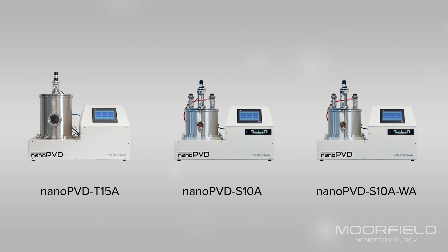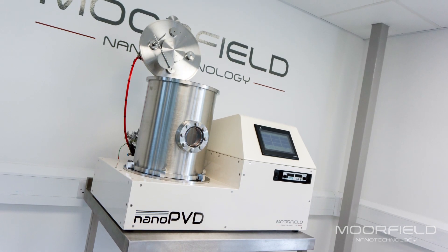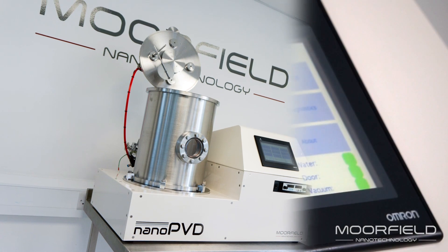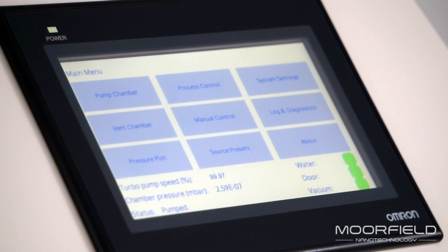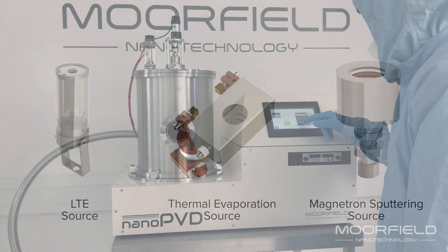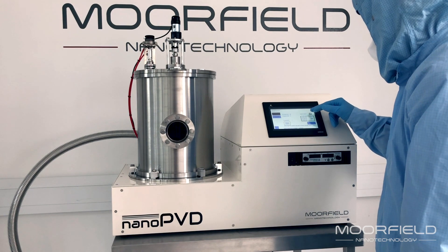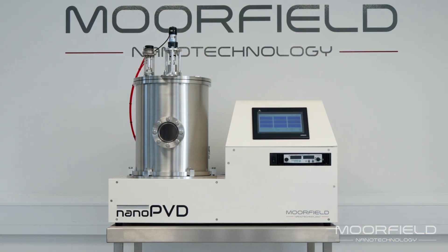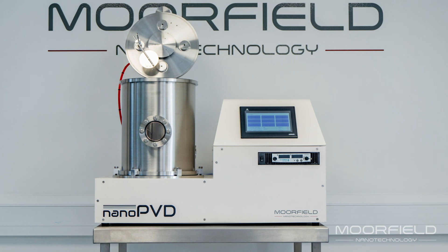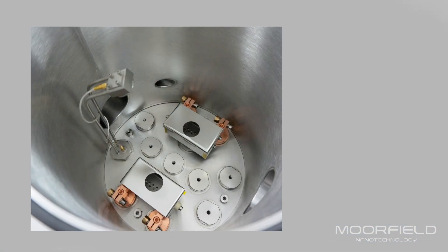All tools are fitted with stainless steel chambers and turbo molecular pumping systems for base pressures better than 5×10⁻⁷ millibar. Tools are available with different coating techniques and are packaged into a compact frame suitable for benchtop location. Model T15A is a thermal evaporation tool with recipe-based process control.